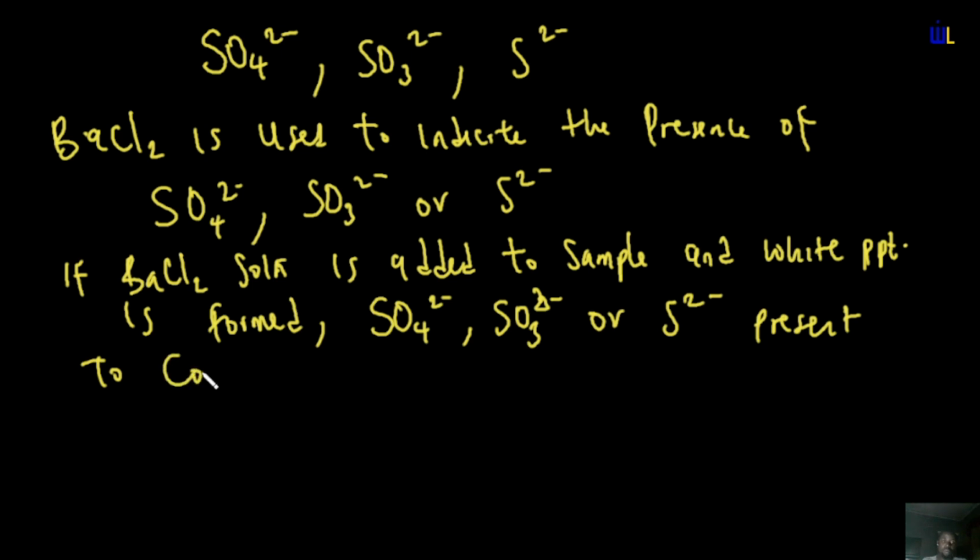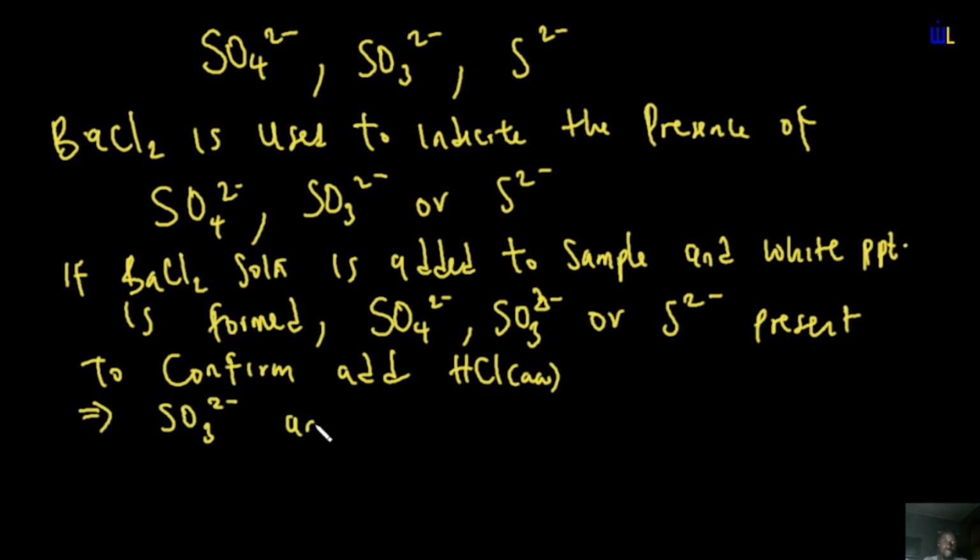So to confirm, add hydrochloric acid, HCl, aqueous. So if you add hydrochloric acid, SO3 2 minus and S2 minus will dissolve in HCl.